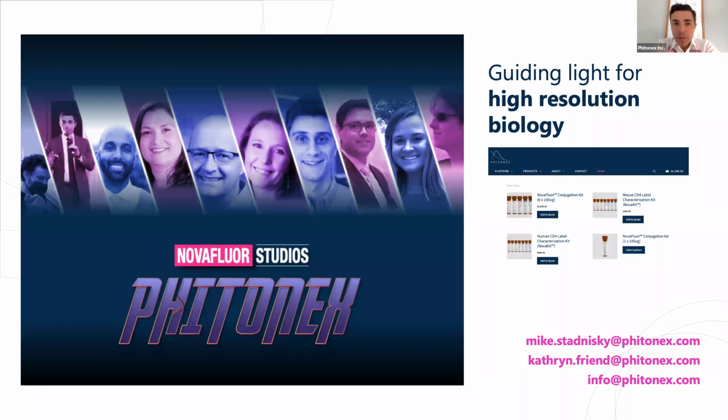Hopefully that would be of use to your users, because it's that tandem dye slide I showed that shows all their problems. It's all the ways we should contrast ourselves against. And even if they said they're not that interested, it still provides them a checklist of things you should be thinking about and asking of your vendor with respect to either tandem dyes or other dyes, which I think on its own is useful, right? Because I think all of us have earned our scars on that.